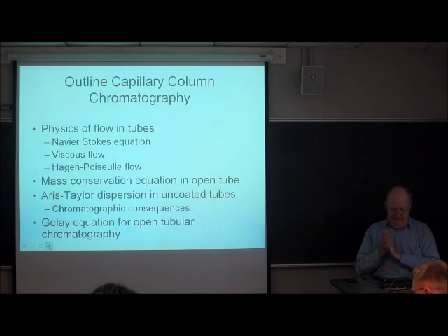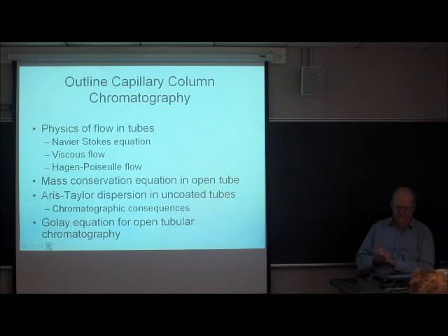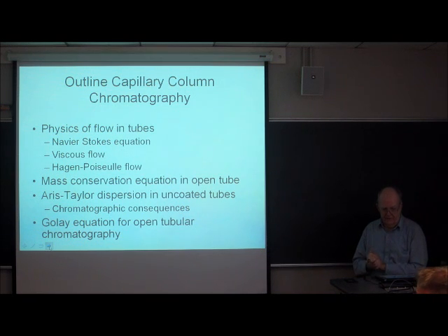Okay. Today we're actually going to begin to start talking about real chromatography. And in particular, we're going to talk about what goes on inside of what's called a capillary chromatography column. The reason I start with capillaries is not a historical reason, it's a reason of simplicity. It's much easier to understand what goes on inside of an open tube than it is to understand what goes on inside of a packed bed.